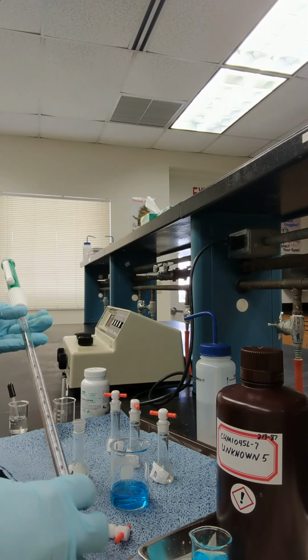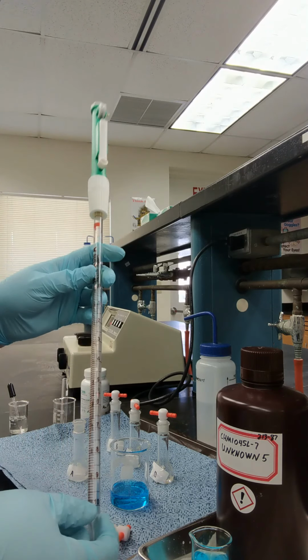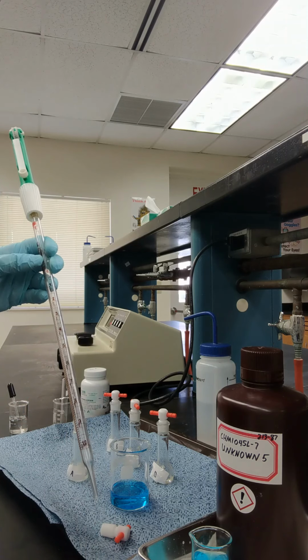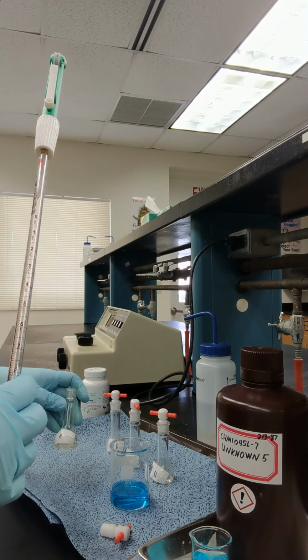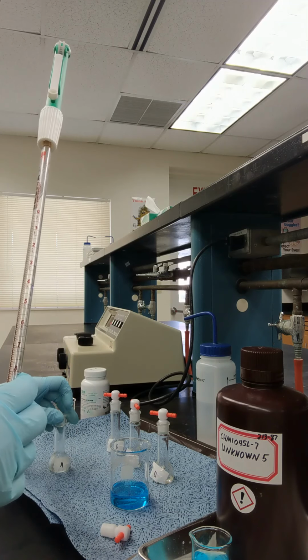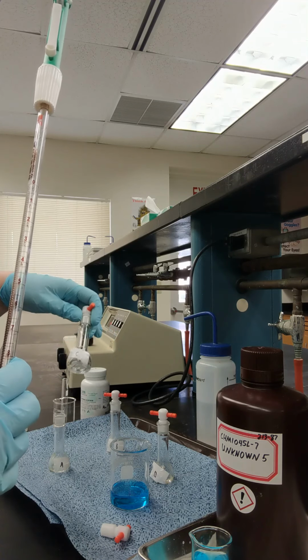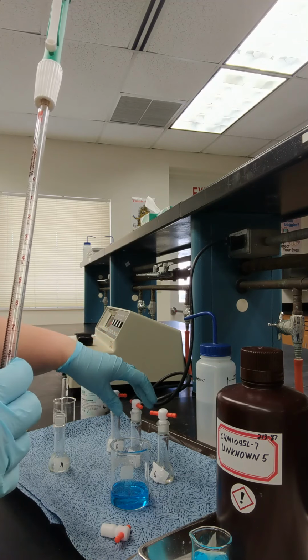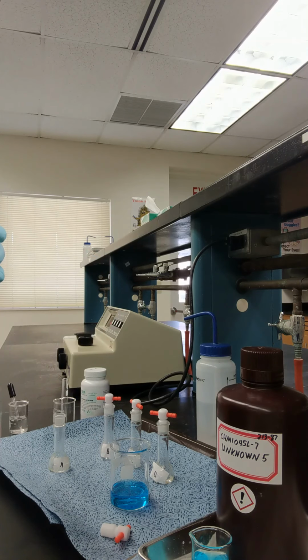So with this pipette, we can measure 10 milliliters. It's calibrated to measure 10. For standard A, I need 2 milliliters, for standard B, I need 4, for standard C, I need 6, and for the last one, I need 8 milliliters.